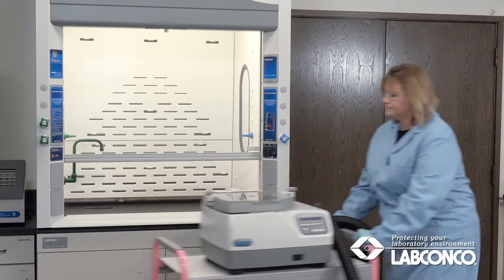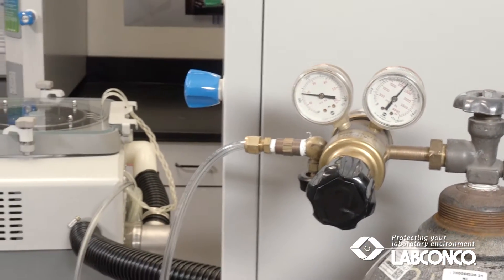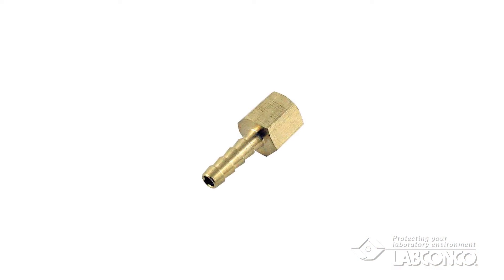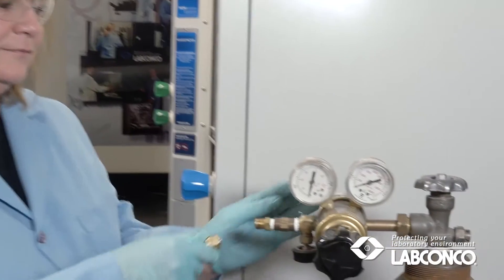Once the RapidVap is in place near a fume hood, the nitrogen will be connected. Install a barb fitting suitable for a 1/4 inch inside diameter hose into the out port of the regulator. Clamp it securely.